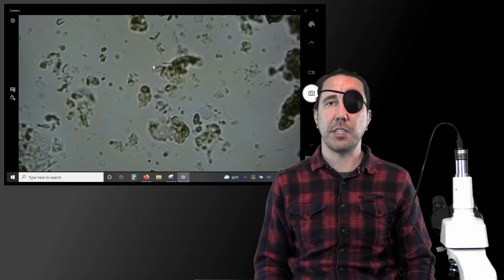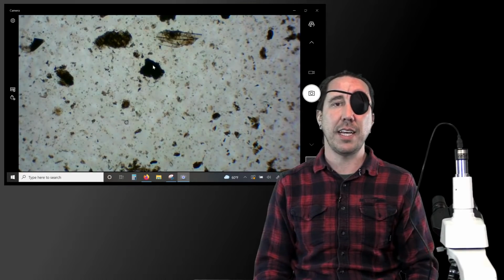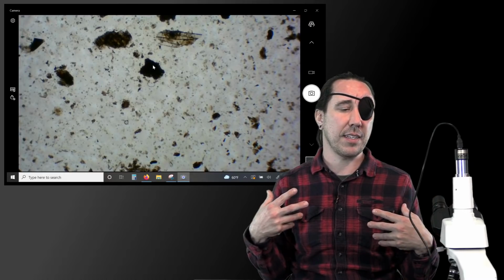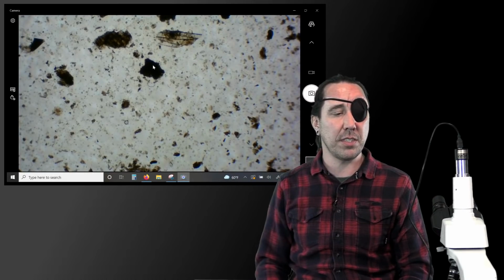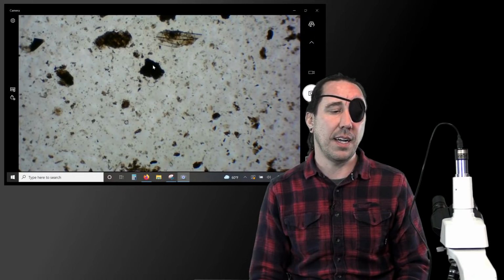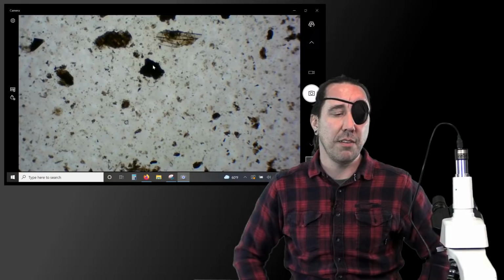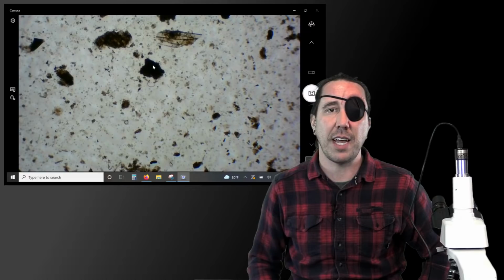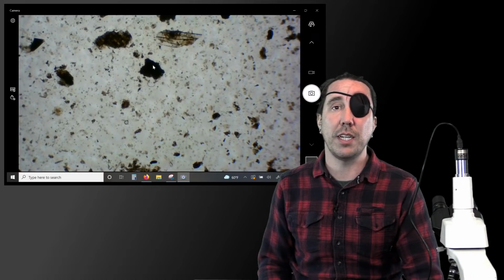Recap for that, because that question just came through. We're going to be using the 4x objective lens and 10x ocular lens to make 40x magnification. We're going to use that 40x to scan for nematodes at first, and then we'll go to the 40x objective lens, which equals 400 times magnification, and we're going to be doing most of our counts and viewing at 400 times magnification.